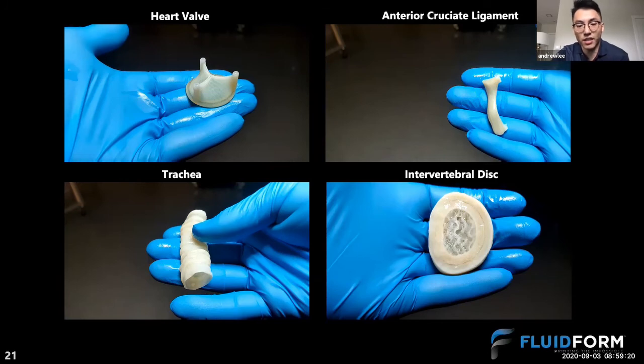The challenge is that after you release it, the material property of that low concentration collagen becomes somewhat problematic at times, because now you have this really soft hydrogel that is hard to handle. It's like very wet tissue paper, really soft collagen material. Even though it can be printed in a three-dimensional structure, it will very easily fall apart when you try to, say, seed cells on it, or push it around with the spatula. So I guess the answer is that it can be printed, and then it's about developing strategies to think about how you would process the final print.